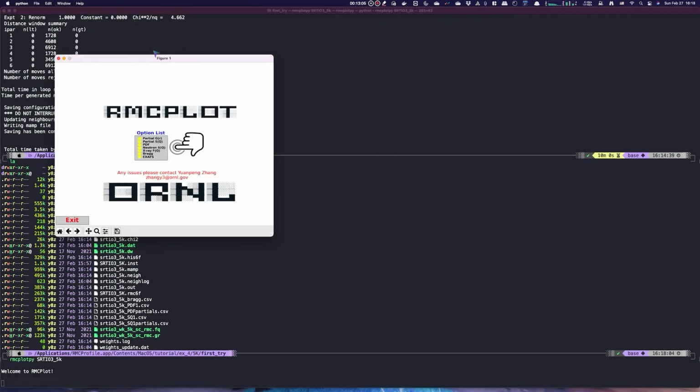And so this plotting program is based in Python. To use this, I guess you have to install the Python environment together with matplotlib, and that's probably the only thing you're going to need to be able to use this plotting program.